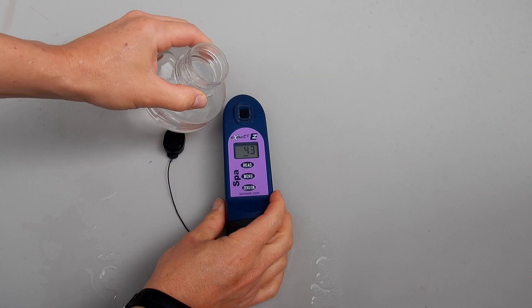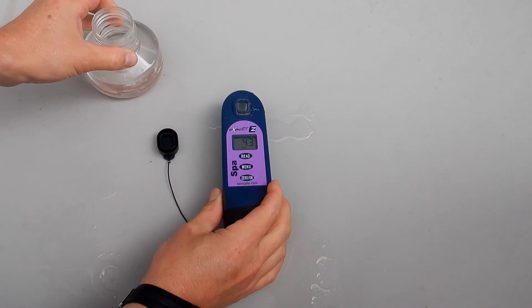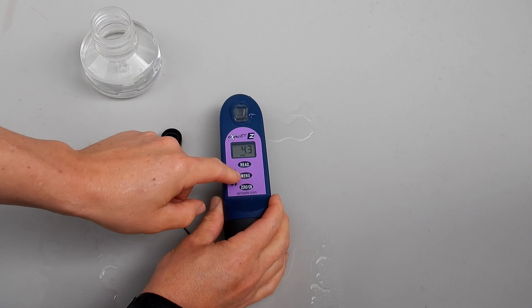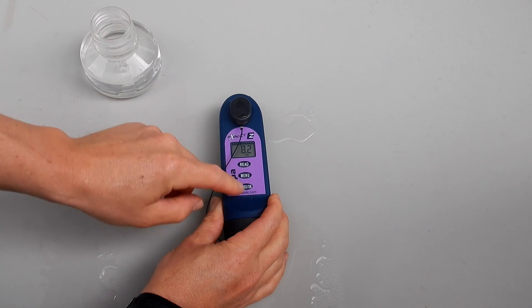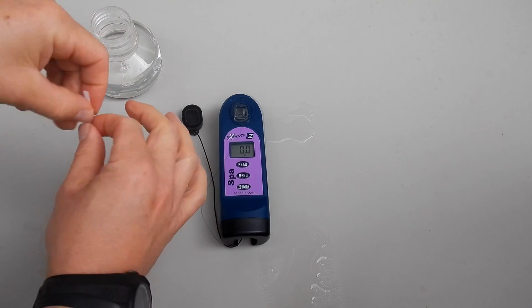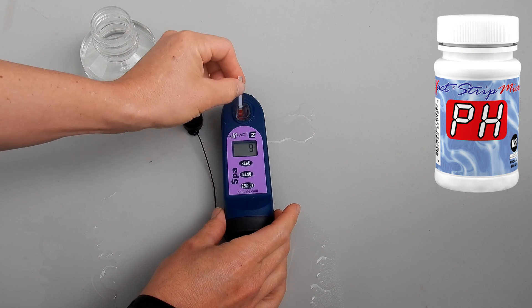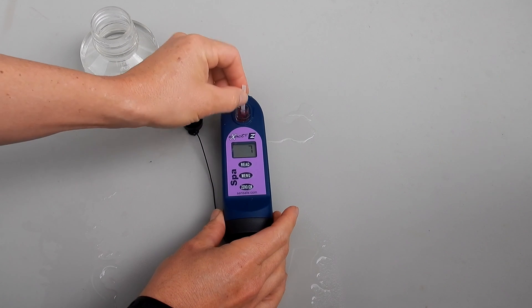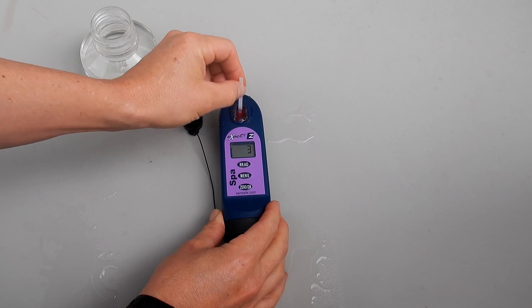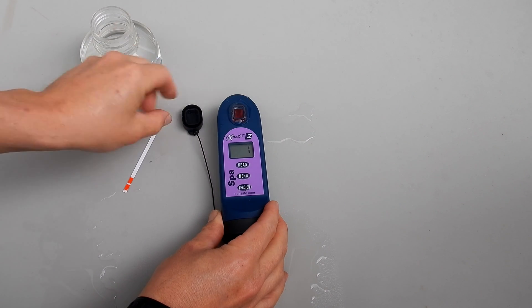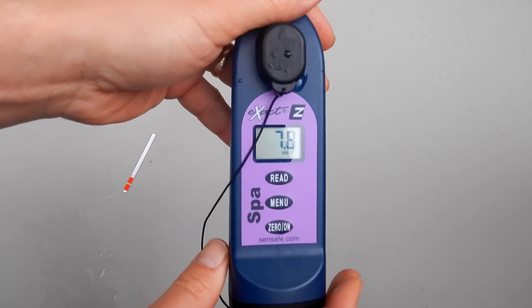Let me fill the chamber up again. I'll do the pH test. You want to zero the unit out every time you do a test. Again hit the read button. Then you want to move the strip back and forth inside the chamber. You want to move it back and forth about two times every second. The pH here is coming in at 7.8.